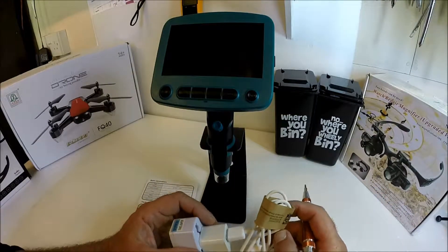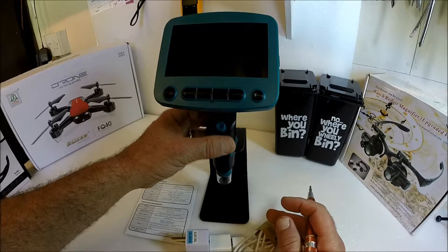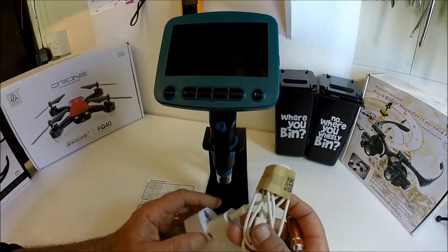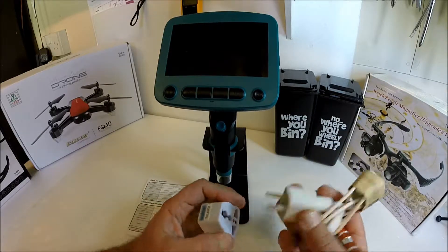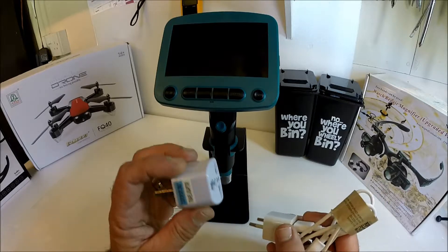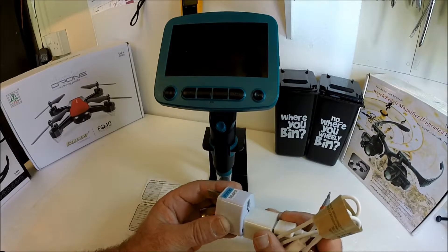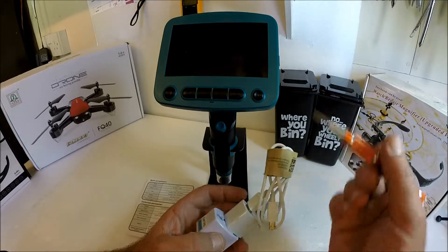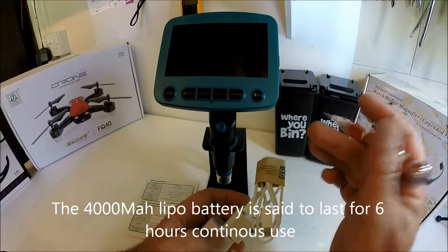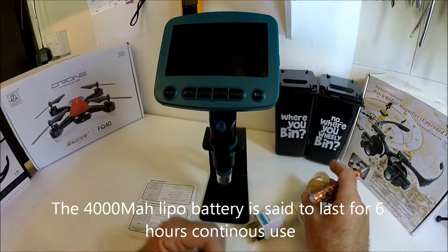Everything is now unpacked from the box and we're looking at the total contents. We start off with the USB lead — you use this for charging. It comes with a Chinese plug; however, Banggood will supply you with a UK adapter. Another good feature is that if the internal battery runs flat while you're using it, you can charge and use it at the same time.